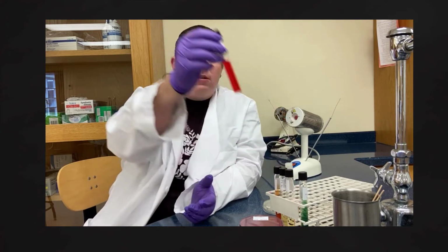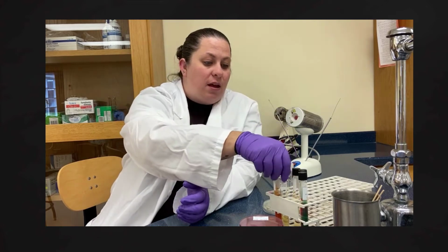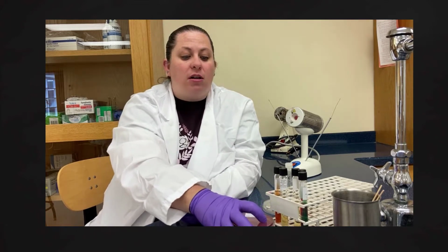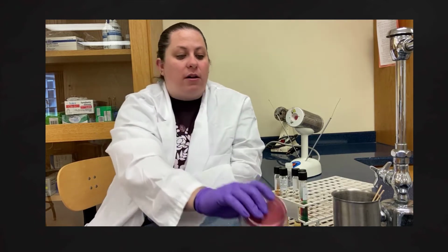We see that it can come in two forms. It can be in a liquid form, which we call a broth. All right, and so in this case, we have a broth. See, it's in a liquid form. Another one, here's a broth that's in a liquid form. Okay, we also can have an agar, which is more of a solid or semi-solid form. A lot of times agars are going to come in plate formation. So we can see we have different types of plates based on the agar that's present.